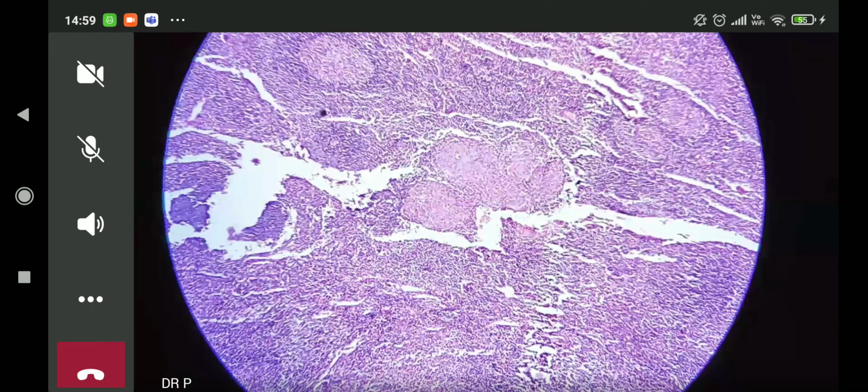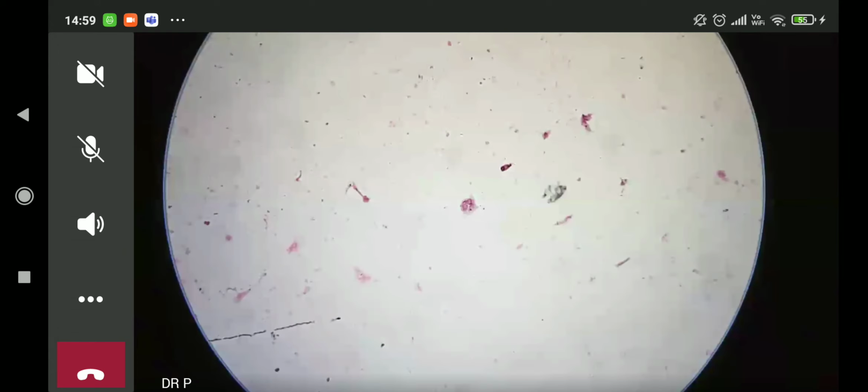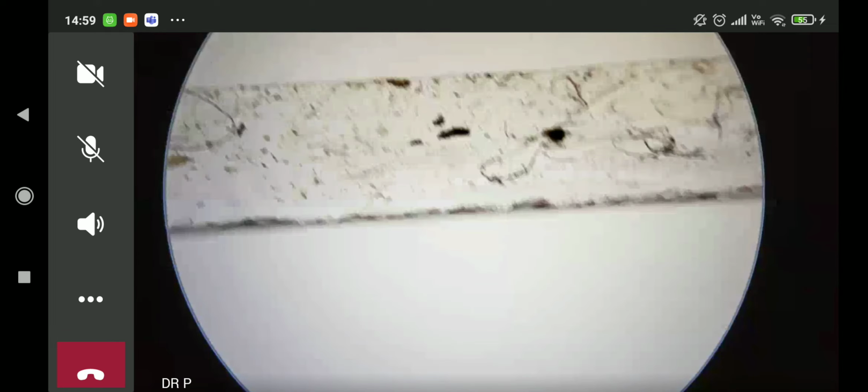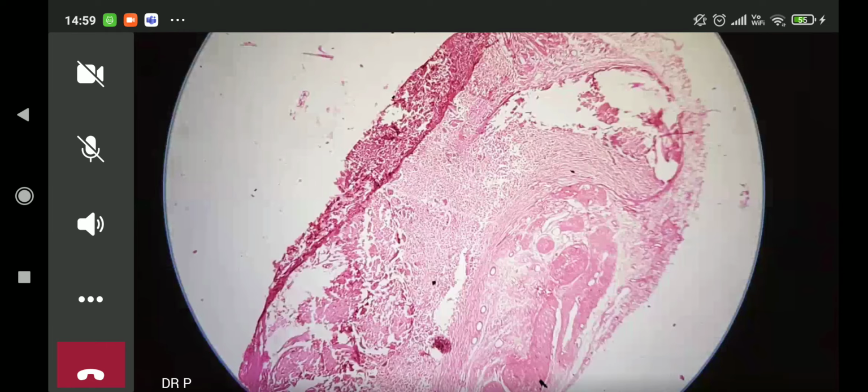So now we go to slide number 2. I hope this was pretty clear. It's a very important slide, tuberculosis of the lymph node. Now, this is the second slide. Now, Ma'am, please explain the previous slide. What was the pink thing which was looking like a germinal center?